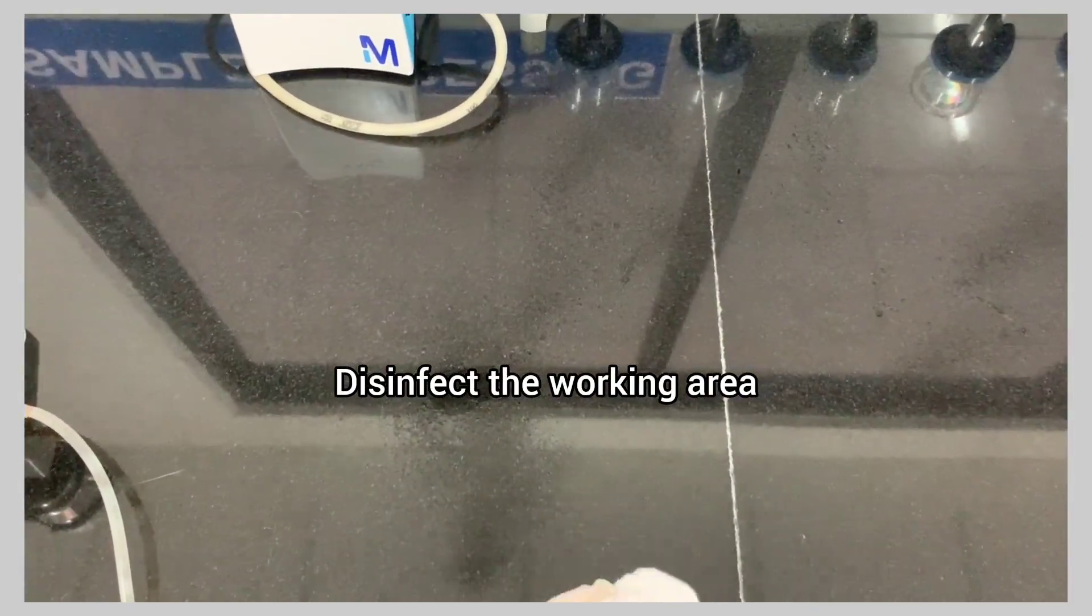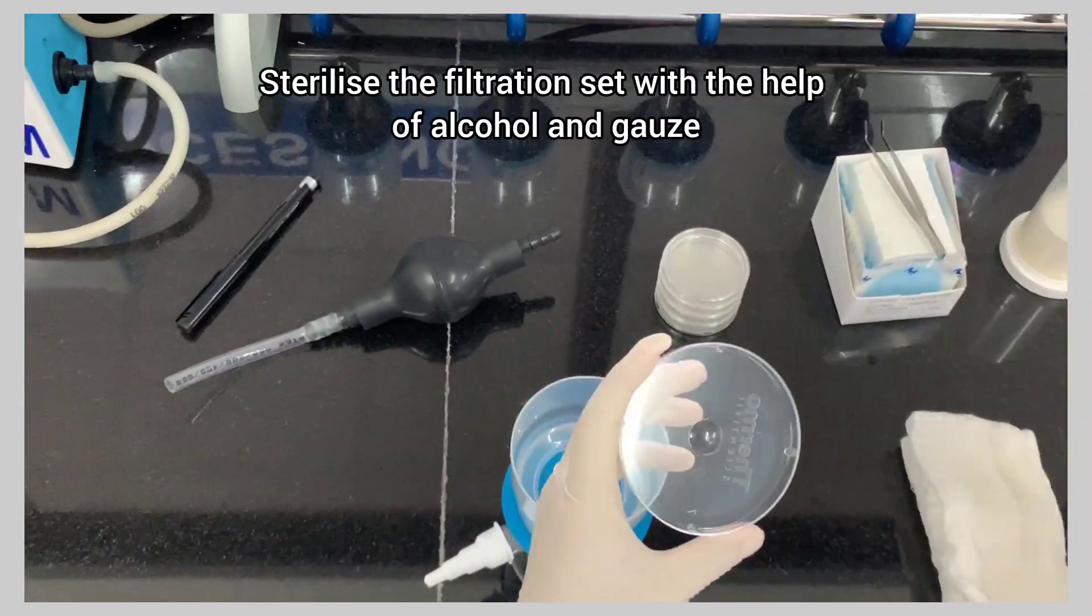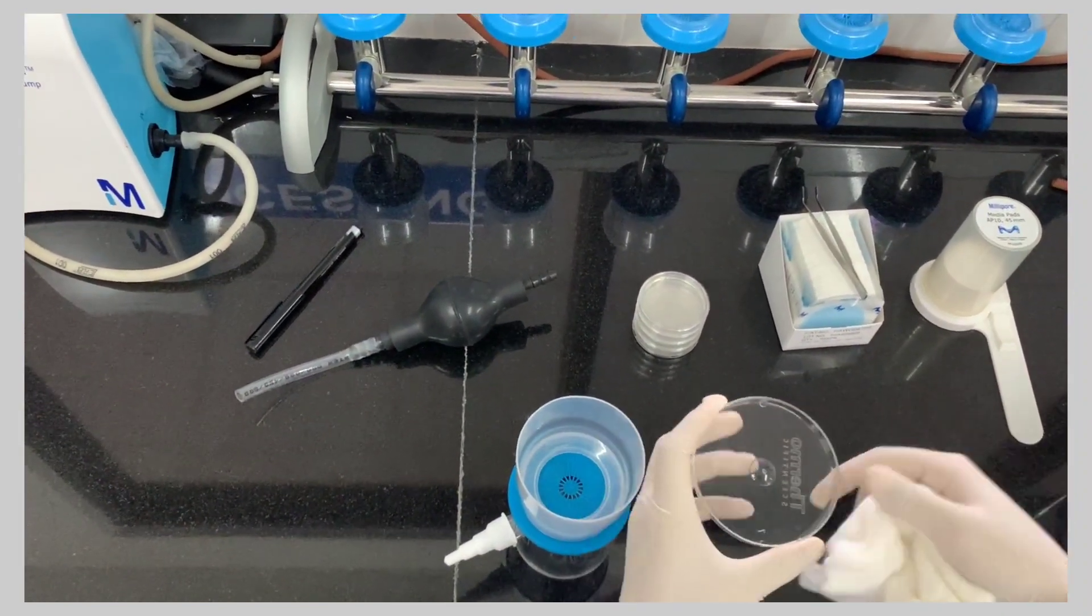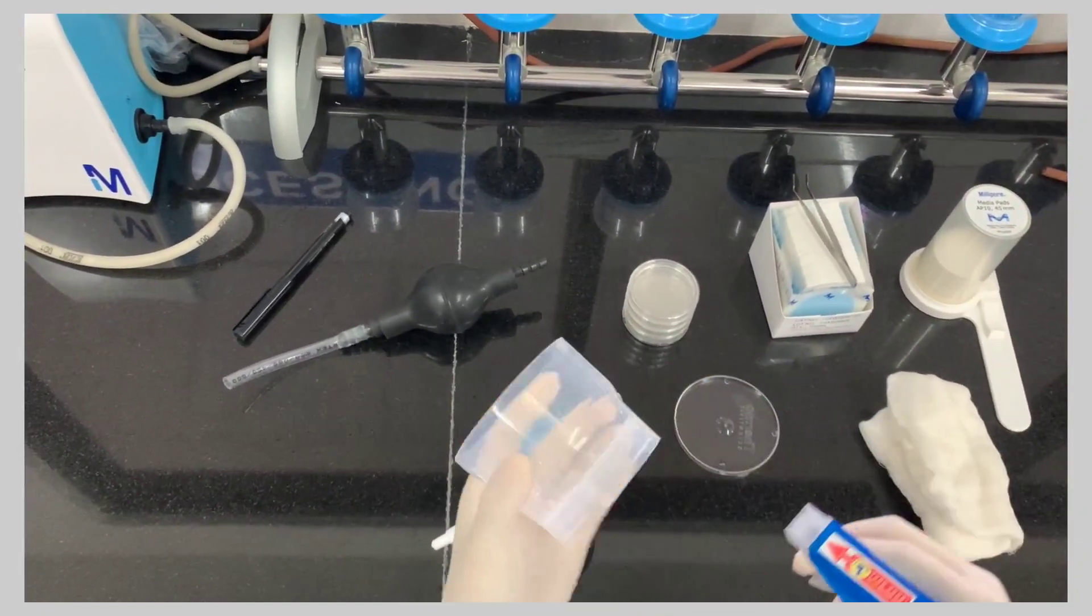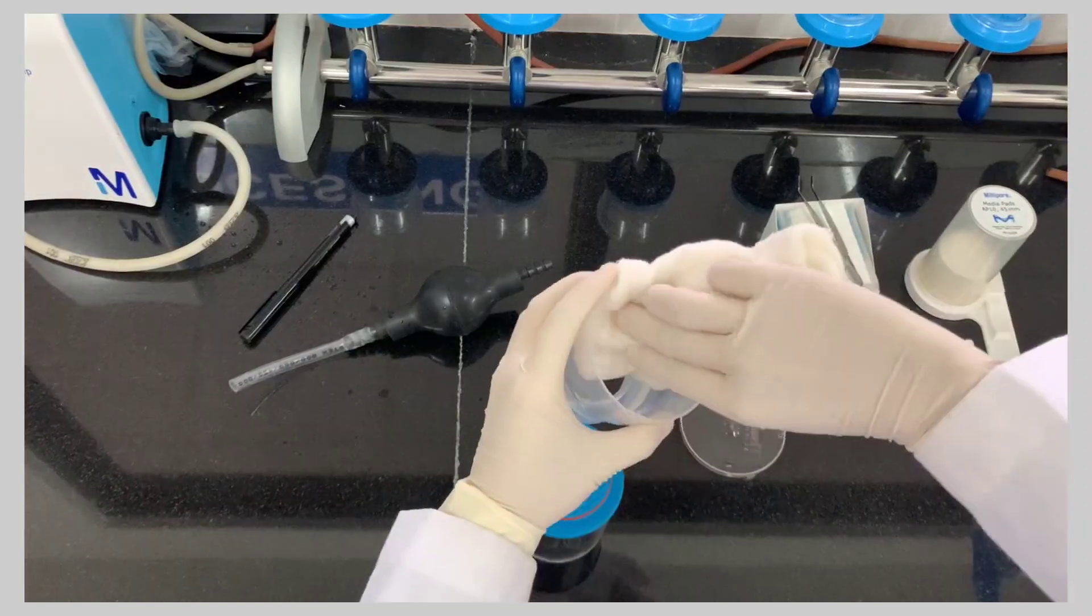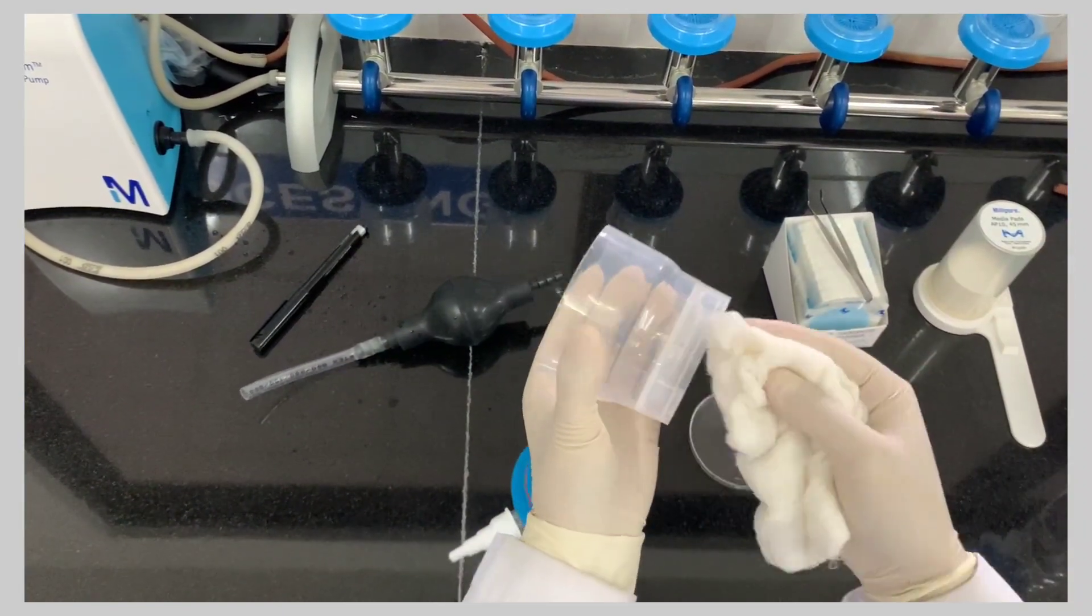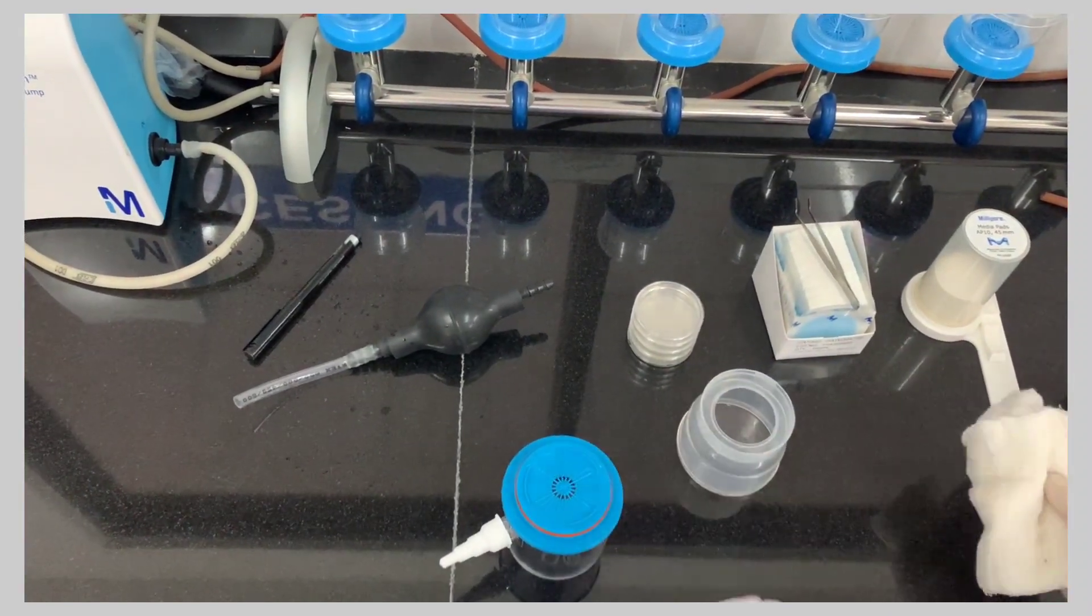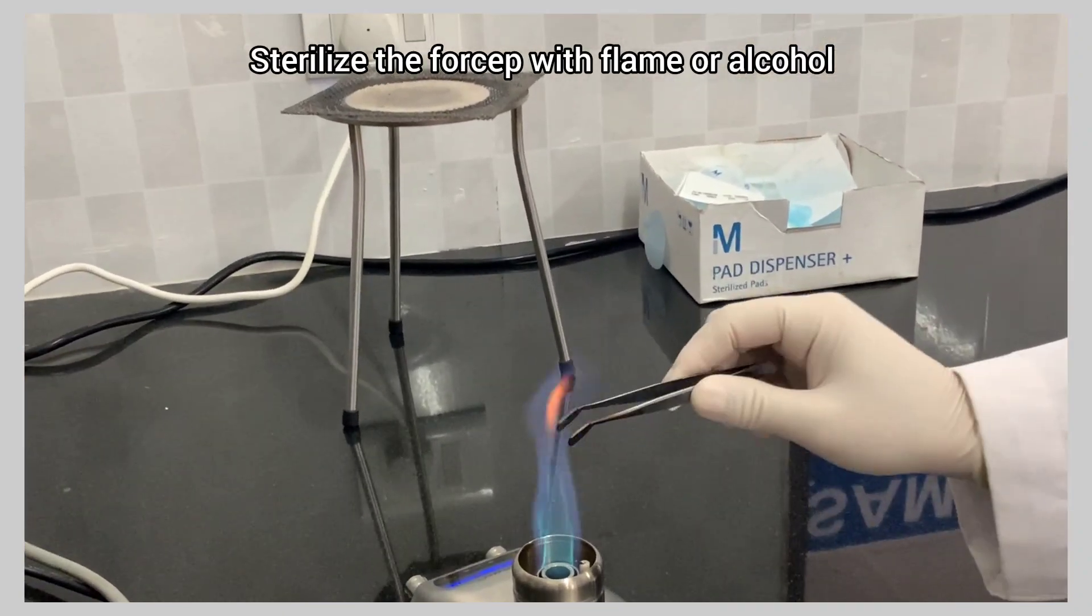Disinfect the working area. Sterilize the filtration set with the help of alcohol and gauze. Sterilize the forcep with flame or alcohol.